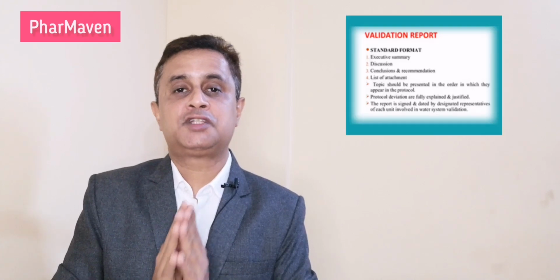Introduce yourself before you explain, and ensure that only the subject matter expert, the person involved in the autoclave validation, and the person who operates the autoclave day to day, these two people, should be there to explain. Then start with your summary report.